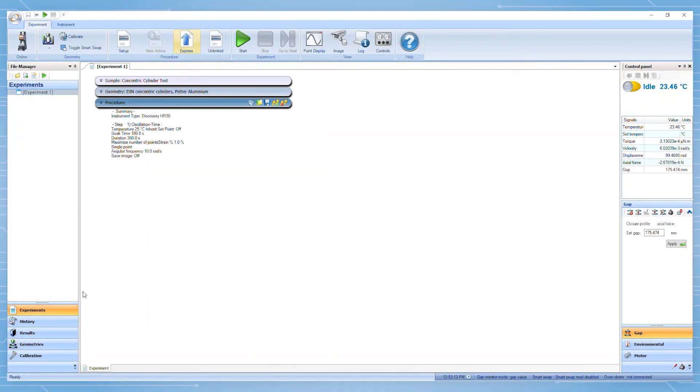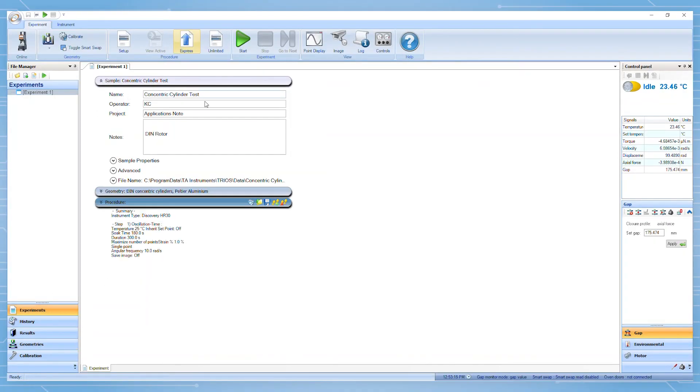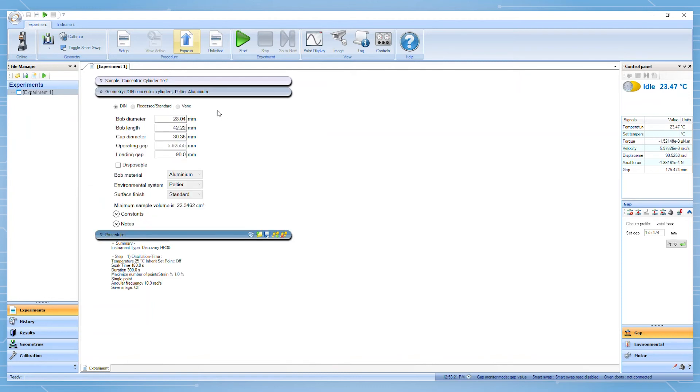When the operator has a desired experiment set up, the cup can be filled with the desired fluid. The minimum volume of fluid required for an experiment as well as the operating gap can be found in the geometry section of the experiments window.